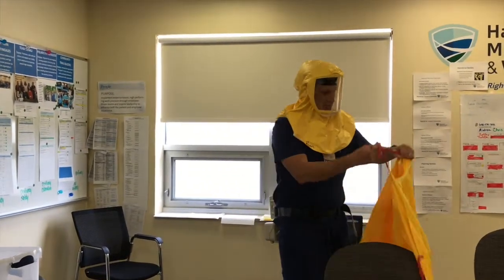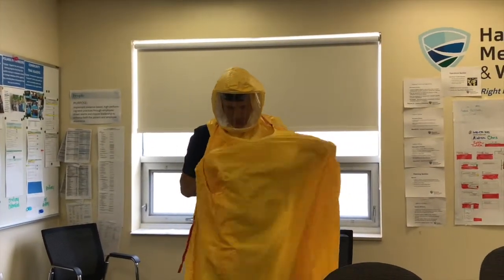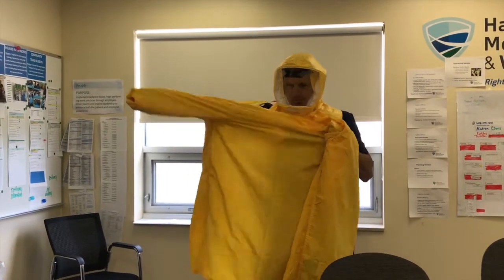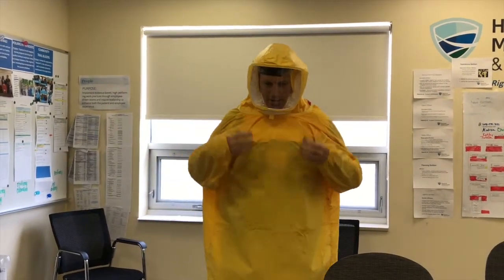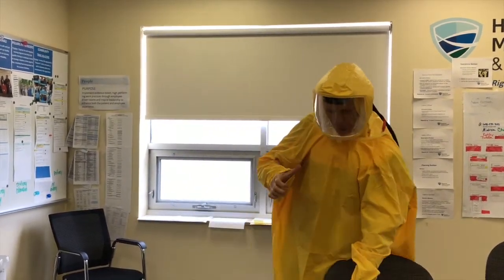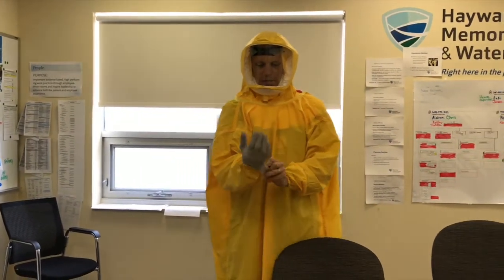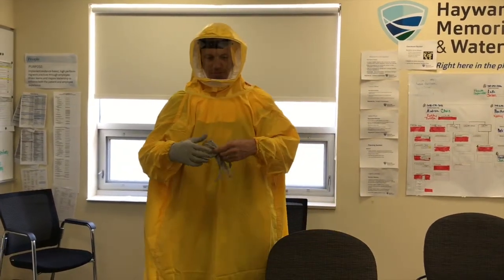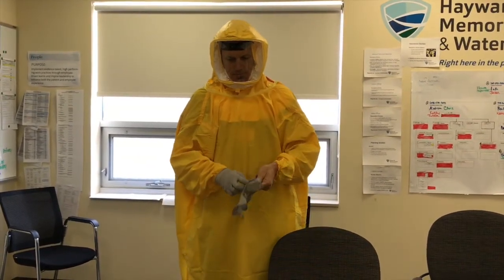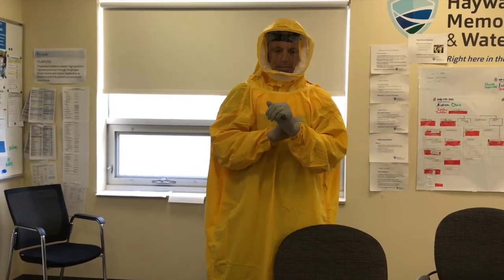Next I'm going to put my gown on. The nice part about these is they are longer, so the gown should cover everything up. Then I'll put my gloves on, making sure that they go over the elastic wrist portion of my gown. And now I'm all set.